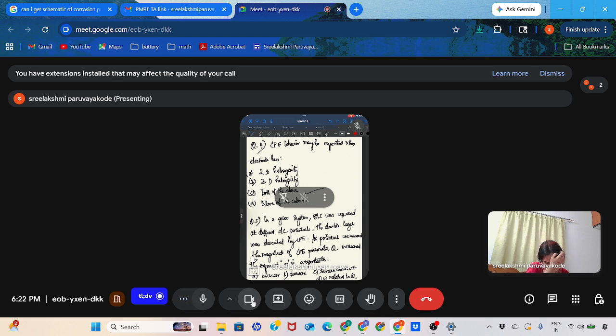When we are increasing the potential, we are seeing that the magnitude of CPE parameter Q is also increasing. So we can expect that in this case, the exponent value will be decreasing. That's the answer.